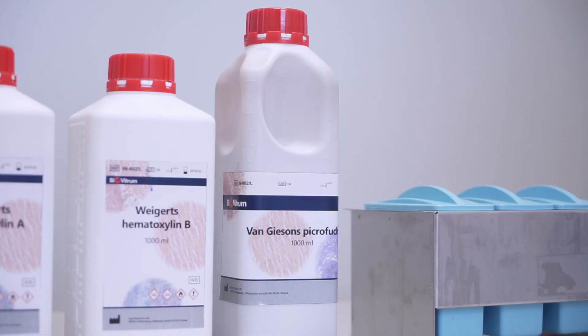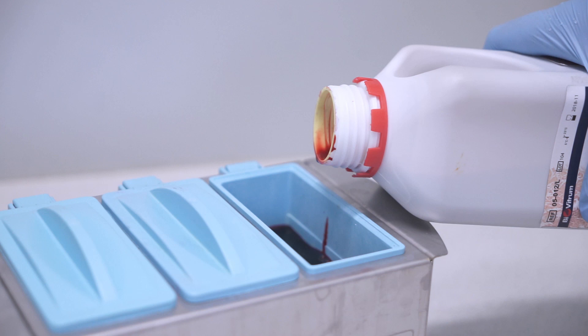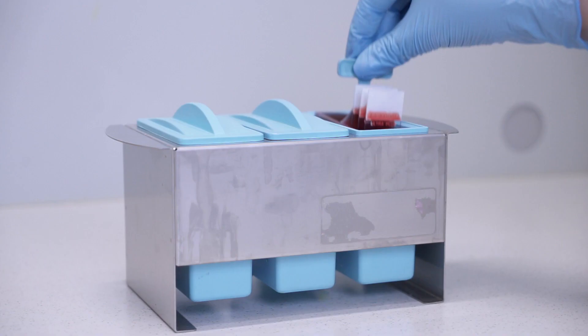Then we use Reagent C, which is a mixture of acid fuchsin and picric acid, and put the slides there for 5 minutes.